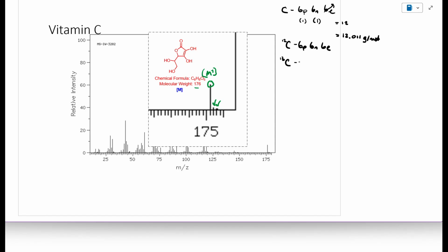And there's carbon-13, which is 6 protons. The number of protons defines the element, so 6 protons has to stay the same for carbon. But carbon-13 has 7 neutrons. The number of neutrons determines the isotope and the atomic mass of the element, and still 6 electrons. The electrons still don't account for any of the mass. So the 6 protons and 7 neutrons give us an atomic mass of 13 AMUs. There's also carbon-14, but it's radioactive and it's very trace, and so it doesn't really impact our analysis here at all.